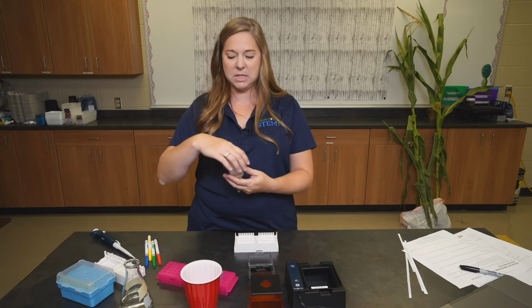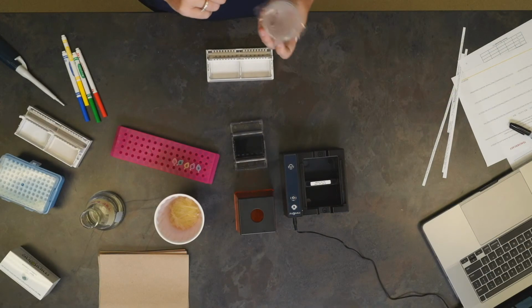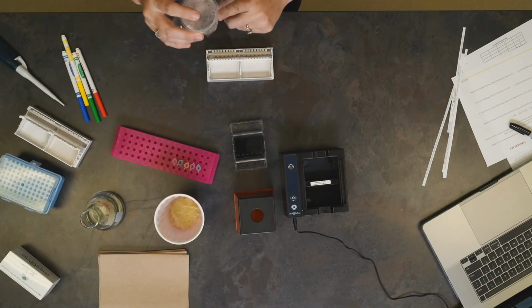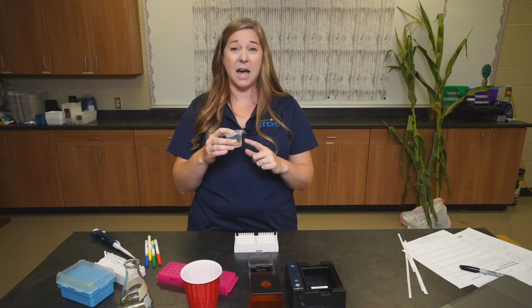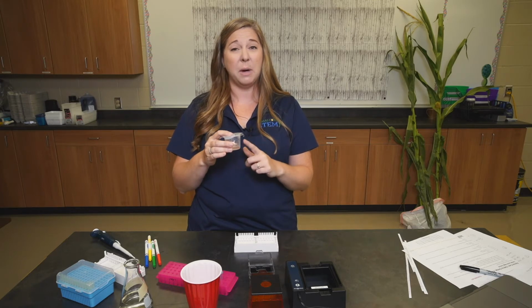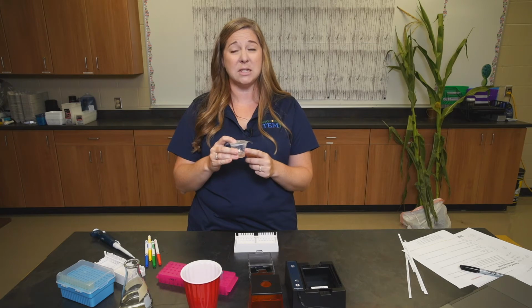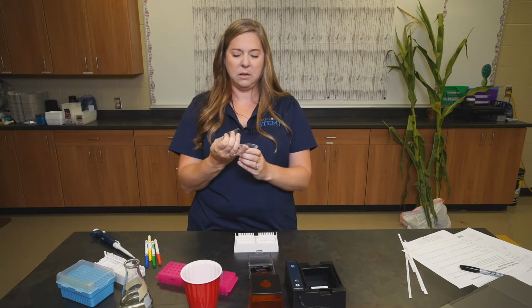In your consumables kit, you will also see that you get these TBE gel cups, if you want to call them that. They will already have the agarose with the TBE and with the dye already in here. So students don't even have to touch any of those chemicals. You peel back the top, microwave it for about 10 to 15 seconds until it's completely melted, and you're ready to go. Peel off the top.